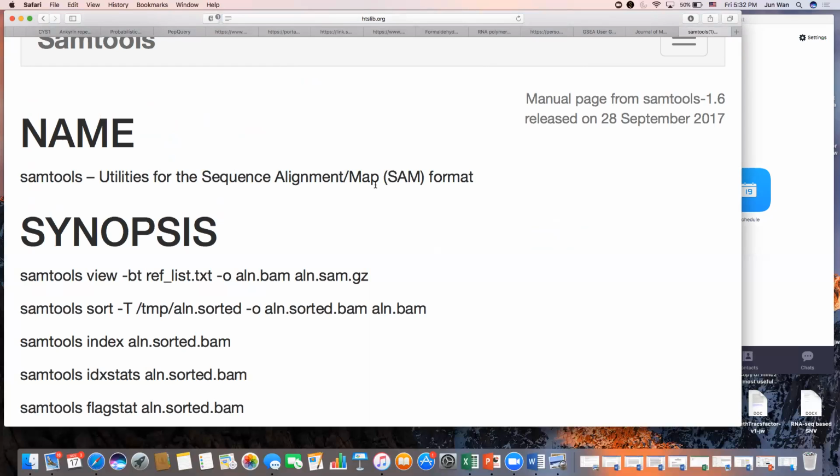Do you remember anything specific about BAMs and SAMs? BAMs are a lot smaller, and the reason is because they're binary. SAMs are all text, so they're typically large, but the binary version is much smaller. It's not readable by a human being unless you happen to be a computer. Do not be alarmed when you look at the size of your BAM file and it doesn't match the SAM. It will be much smaller. It'll still be a large file, but much smaller than the SAM you generated from the aligner. So this is straightforward and simple to use.